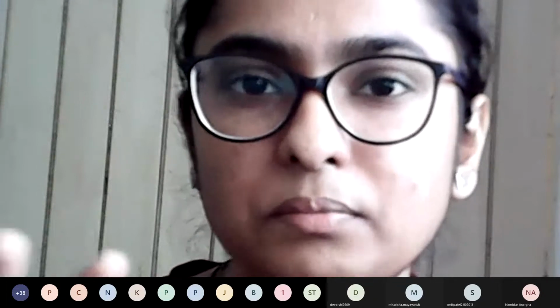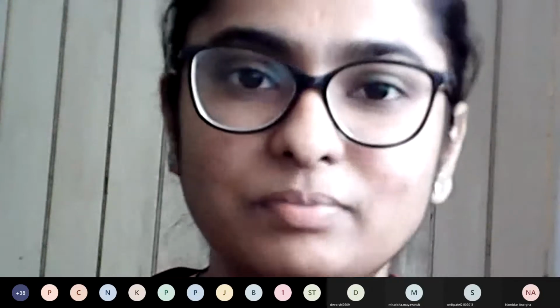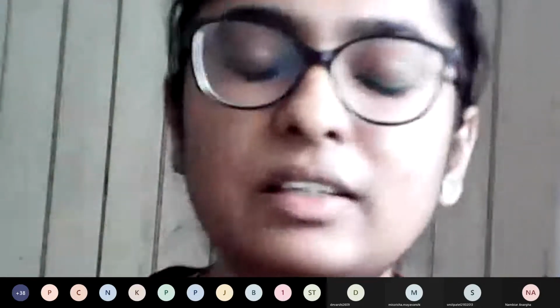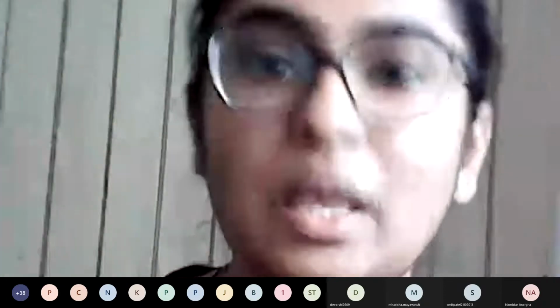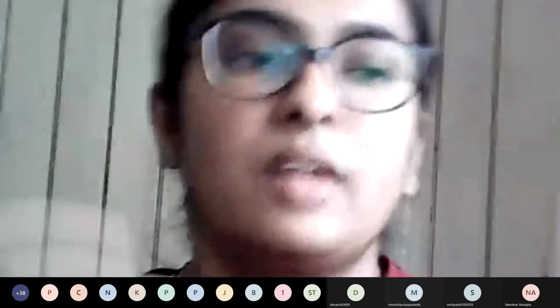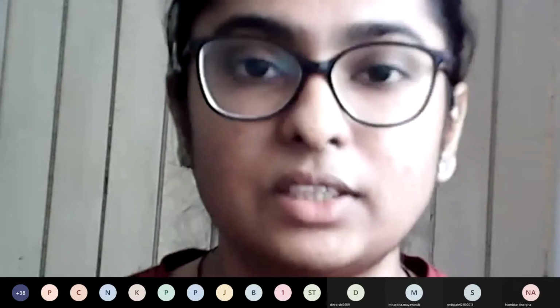That blue will be somewhat like, you all know, the color of a peacock's neck, right? Very dark, beautiful blue. That kind of color you will get, a little lighter version of that, but that shade. That is the endpoint color. I'm describing the colors so that you can imagine what kind of blue it is. So that is the end color. Now as you go along with the titration, slowly this original dark pinkish red, wine red color will start shifting towards blue.